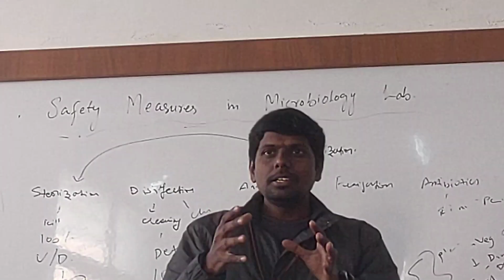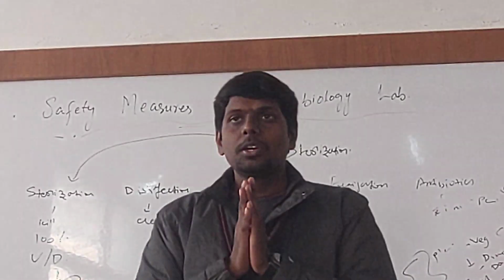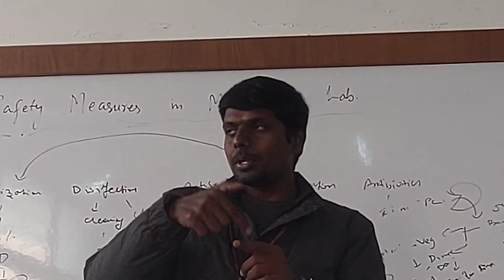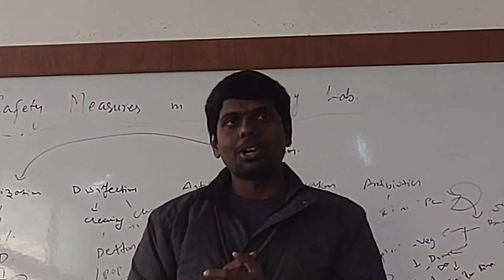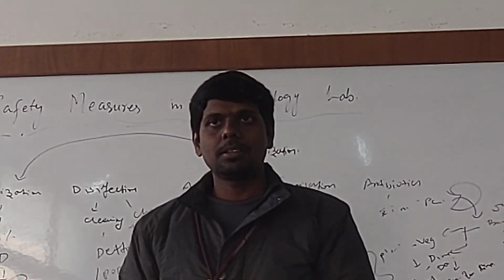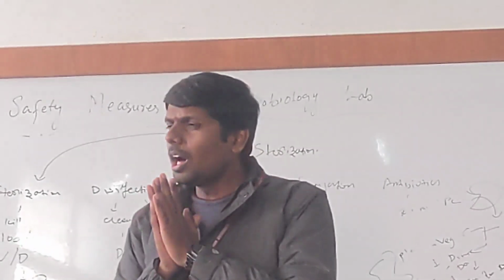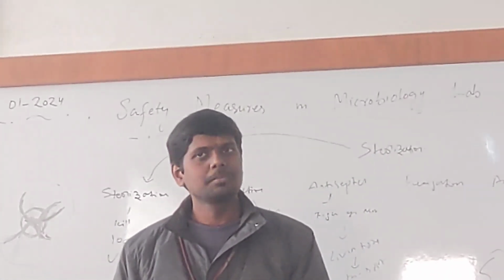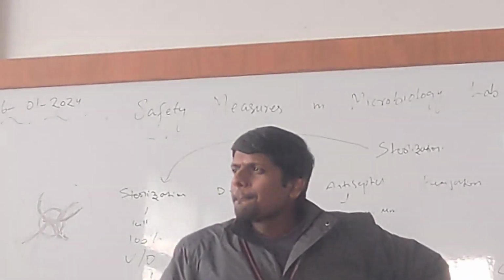So how can I sterilize a plastic tube? Catheters are very costly, 5 to 6,000. A simple pipe that you keep in the urethra, in the bladder, very costly. So they will go for sterilization sometimes. That depends. Tell me, how to sterilize a plastic material? Can I keep it on an open flame? No, sir. Then what should I do?